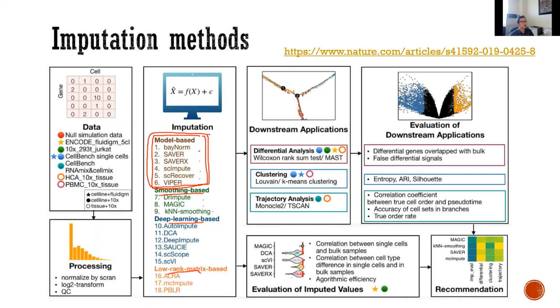So once you finish the imputation, you may have better power in the downstream applications to do the clustering, trajectory analysis, the differential expression, network. That's an assumption.